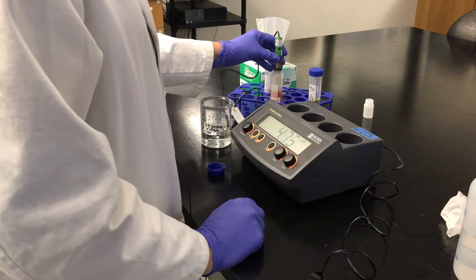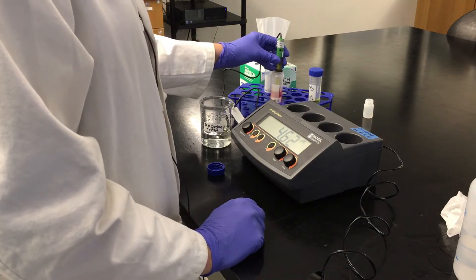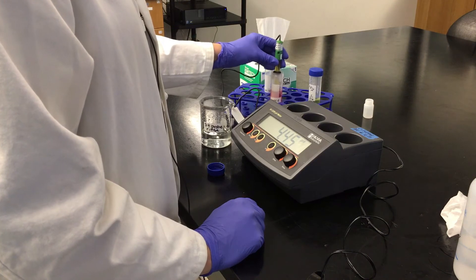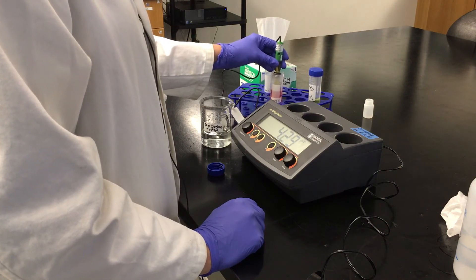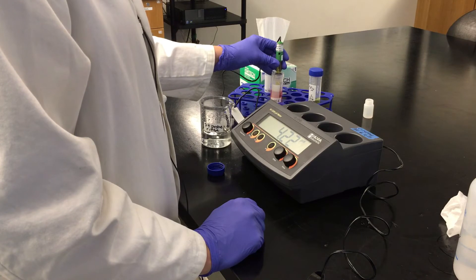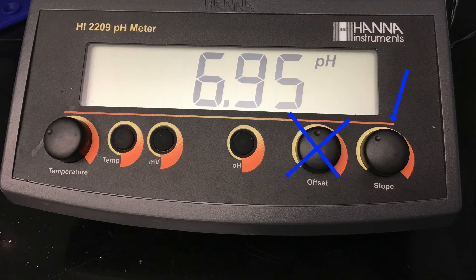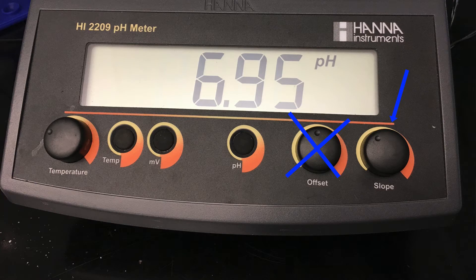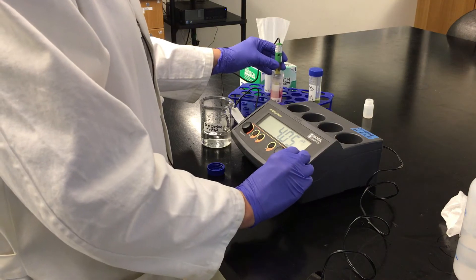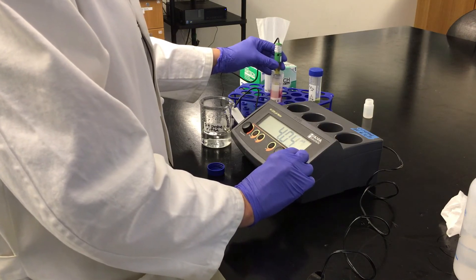Okay, I'm going to give it a little bit to stabilize. Now that it's stabilized, I'm going to adjust the slope knob. Not the offset, but the slope knob until it reads pH 4.